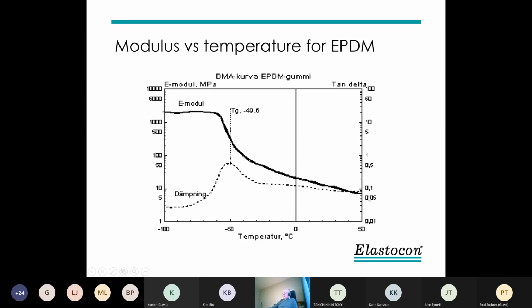So it means that even within, say, the normal temperature range of rubber in a laboratory, that is 23 ±2 Celsius, there is quite a big difference in, let's say, hardness, which I measured once, just within a 4 Celsius degree range. And that is something like half a degree in hardness, at least. So the temperature is very important.